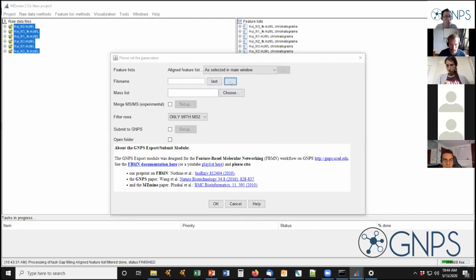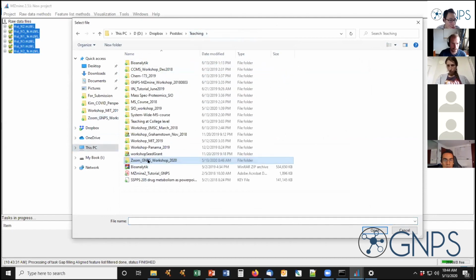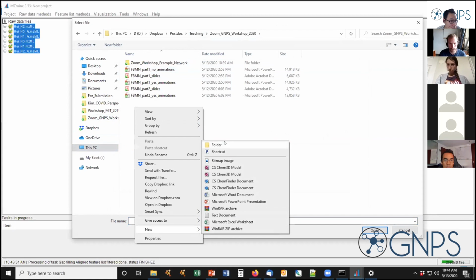Therefore, I go here on these points and browse to a folder.